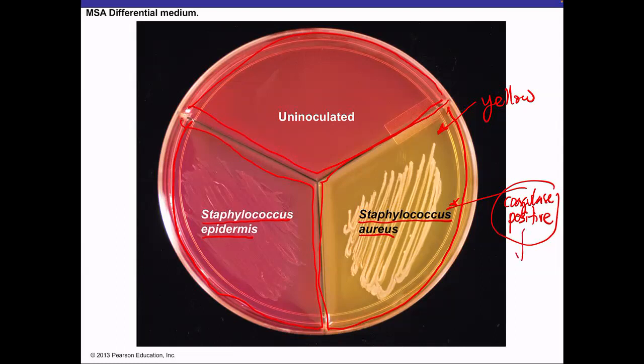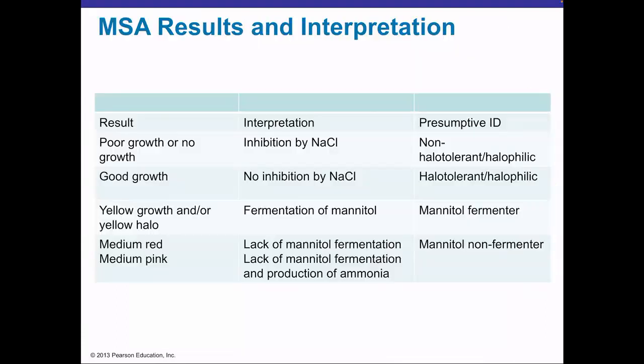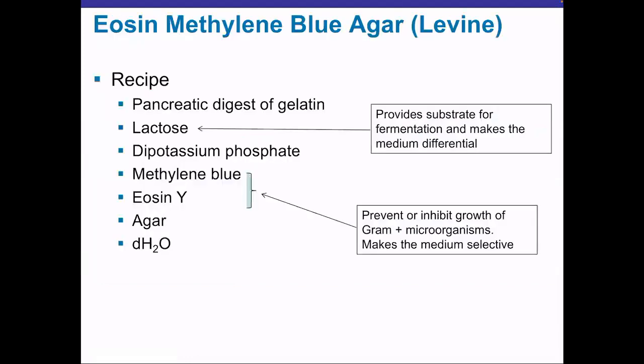Look for the coagulase test. Okay. Let's now go to the third... Oh, by the way, this is a table that is summarizing what I just explained verbally in the previous slides about the mannitol salt agar medium. Let's now go to the third medium that we're discussing today.